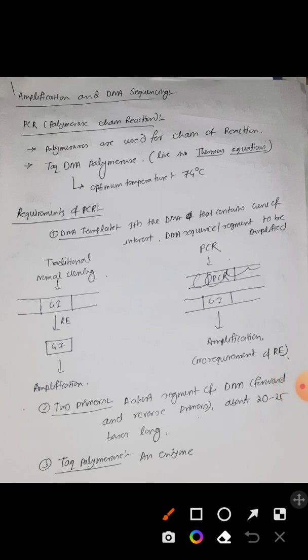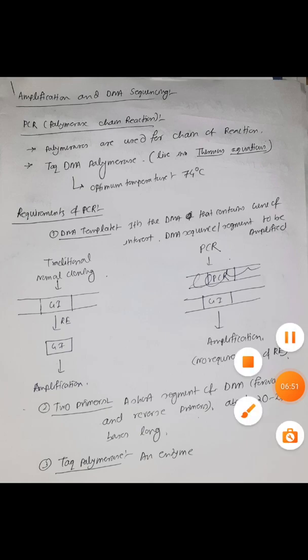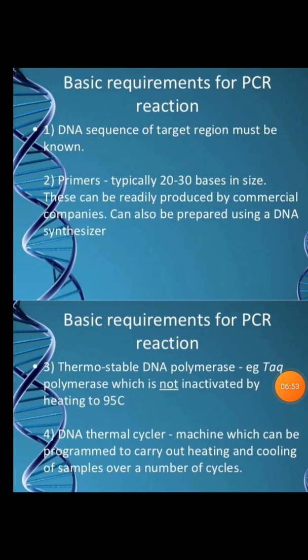And most importantly, the thermocycler machine, or in general, the PCR machine. Okay, so what is the utility of this PCR machine? Let me show you the PCR machine first.